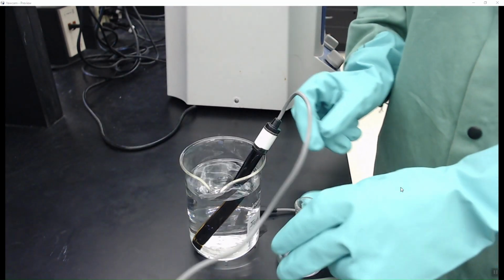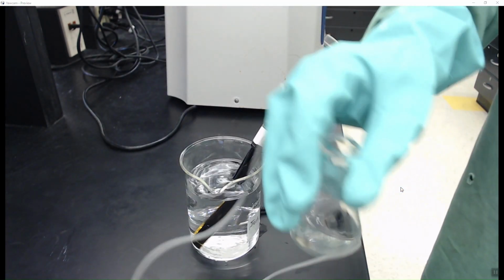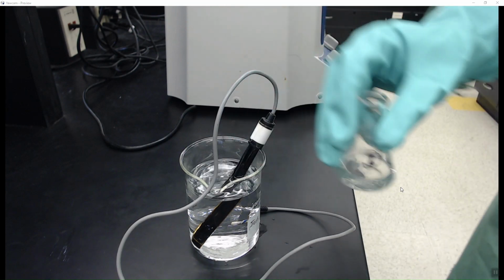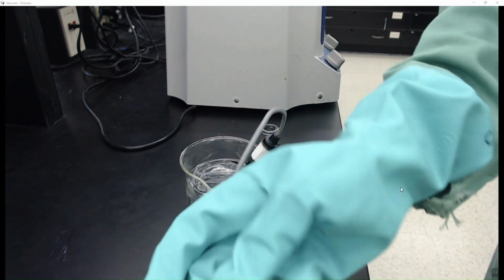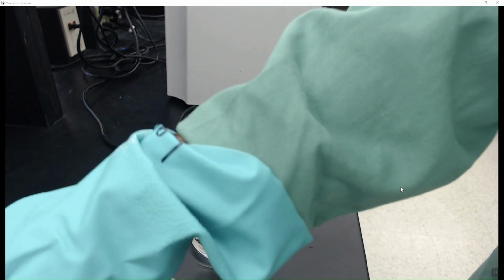I also have my 1% solution here. So what I'm going to do first is plug the conductivity probe into the microlab, into the port that says conductance.